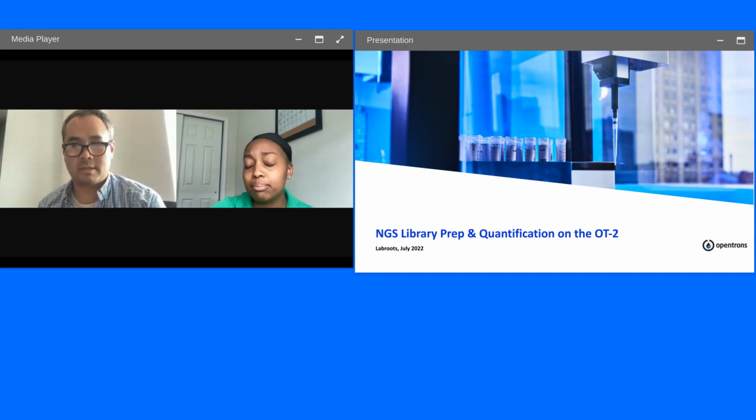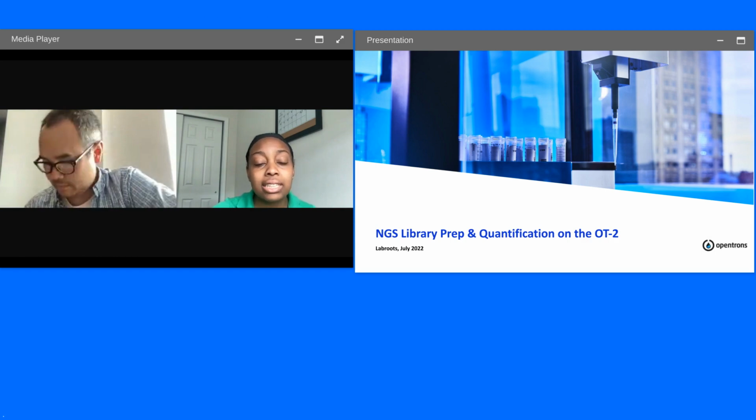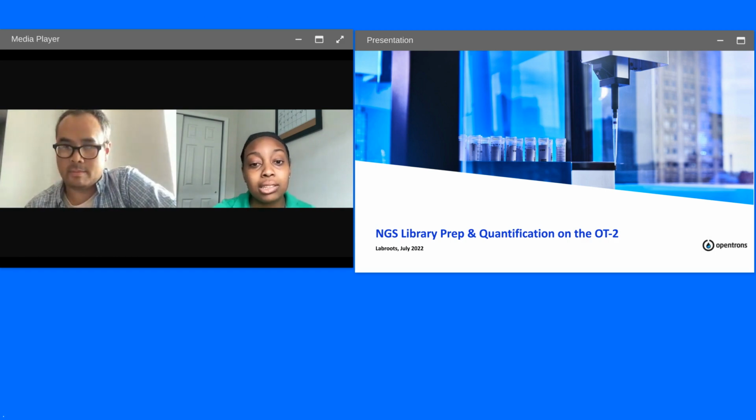Very related to protocol design, we have a question here on the tip reusing that you mentioned during the presentation. Is tip reusing now programmed into the GUI or only Python scripting? So please elaborate.